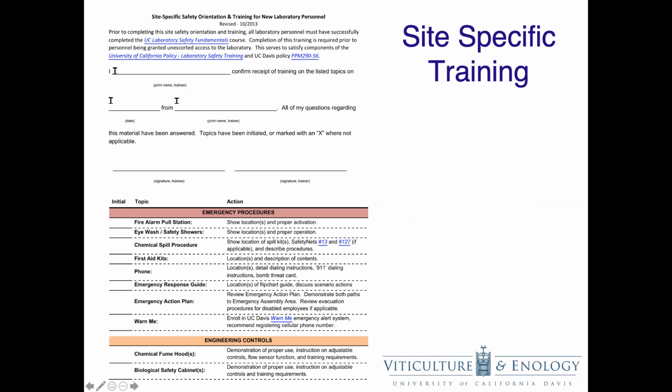Site-specific training. This is an example of the site-specific training checklist. You will need to receive this training prior to beginning work in the laboratory.